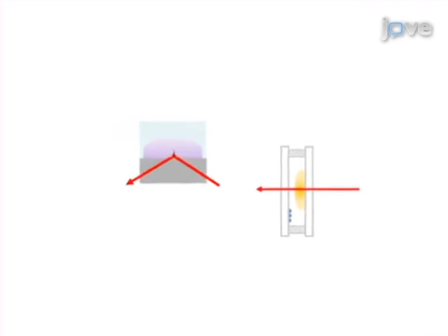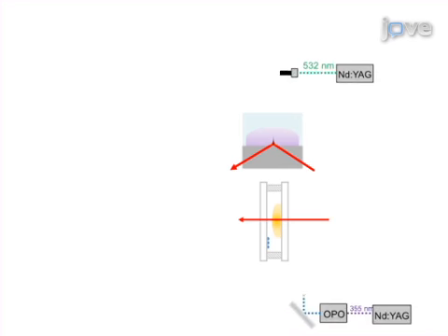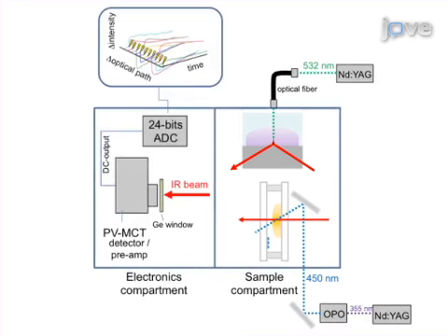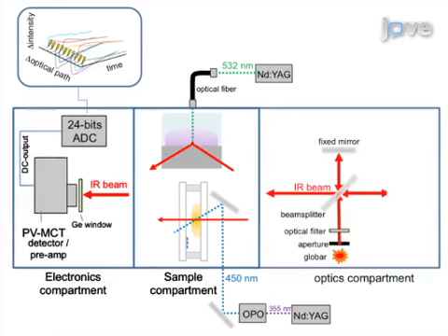The second step is to excite the sample with a nanosecond laser flash of suitable wavelength to initiate a photocyclic reaction in the protein, detecting time-resolved changes in the intensity of the infrared light interacting with the sample. Next, the above process is repeated at discrete positions of the mobile mirror of an interferometer, which controls the optical path difference between two split beams, until a complete time-resolved interferogram is recorded.